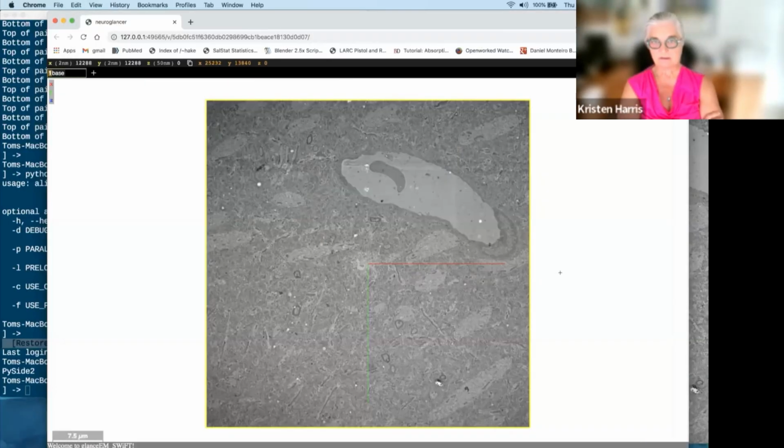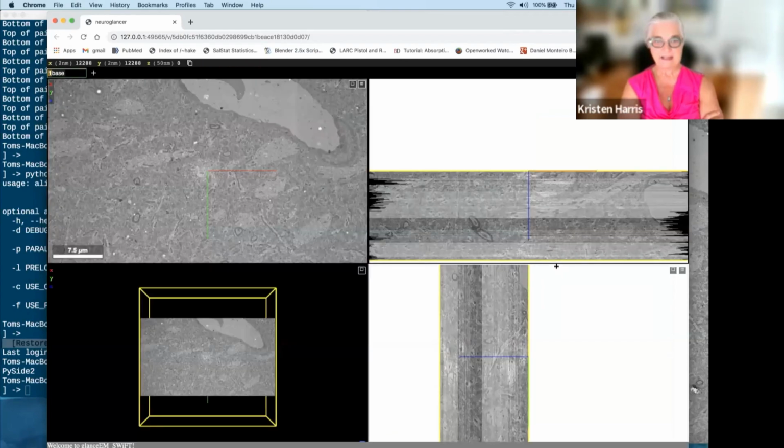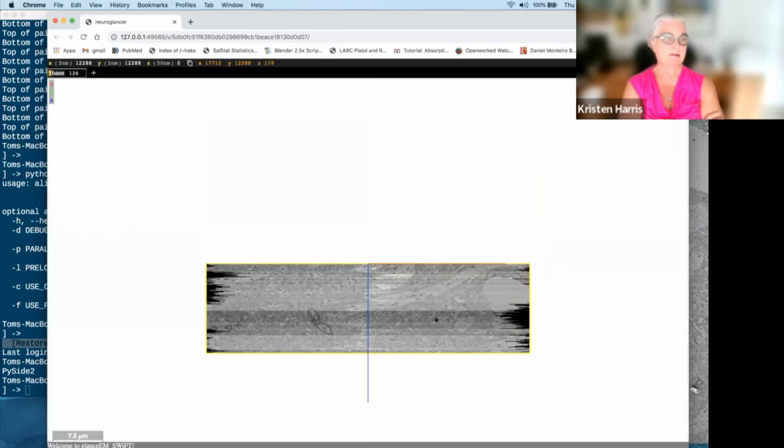I would love very much for you to begin to integrate the thinking about Tomo. The reason for that is that in the big picture of this whole effort, we really want the virtual sections to be dialable in this environment as well. So you can say, okay, it came in at a Z of 50 nanometers, I want it now to be each section 2 nanometers.